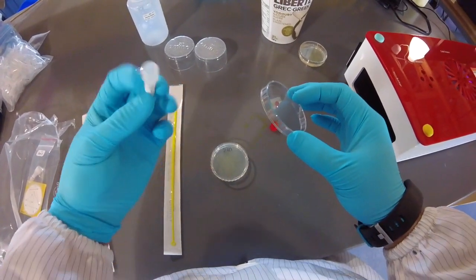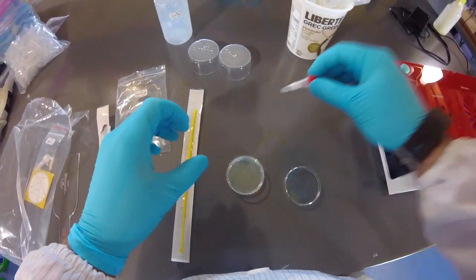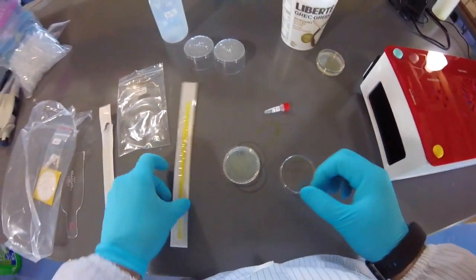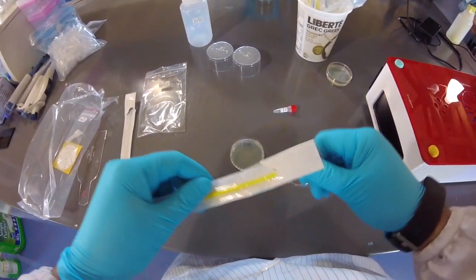Whoop, there we go. Well, that's more than half now, but so be it. So we're done with these cells here. You can see I probably put in about two-thirds. It's okay though. It just means it's going to take a little longer to dry.